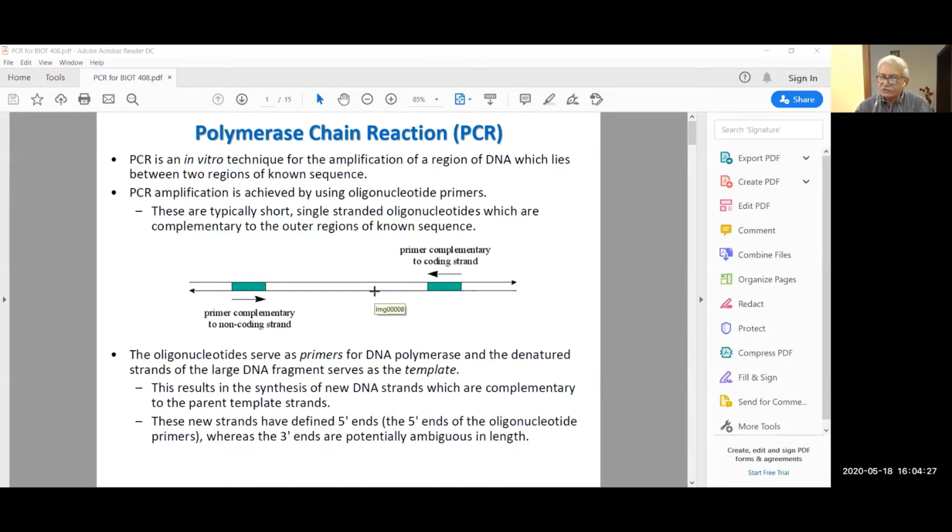Because we have gone through this lecture already, and I have mentioned that it is just a procedure, but understanding what is going on in this procedure is very important. So I will concentrate mainly on what is going on, besides the procedure that I will discuss briefly with you. Okay? Any DNA replication mechanism requires a DNA polymerase. In this case, we have a DNA polymerase which is very resistant to high temperatures, and that's Taq DNA polymerase.